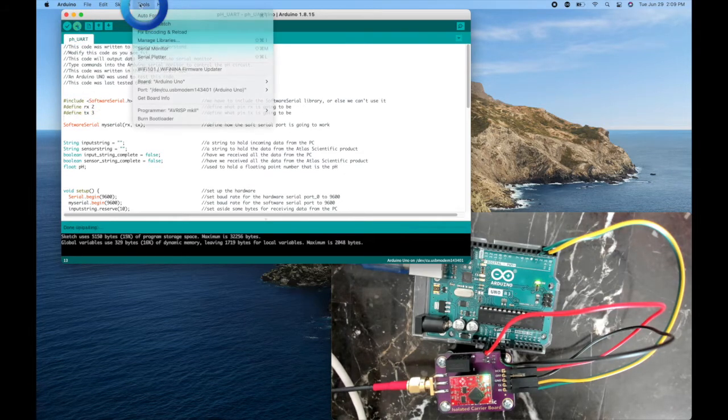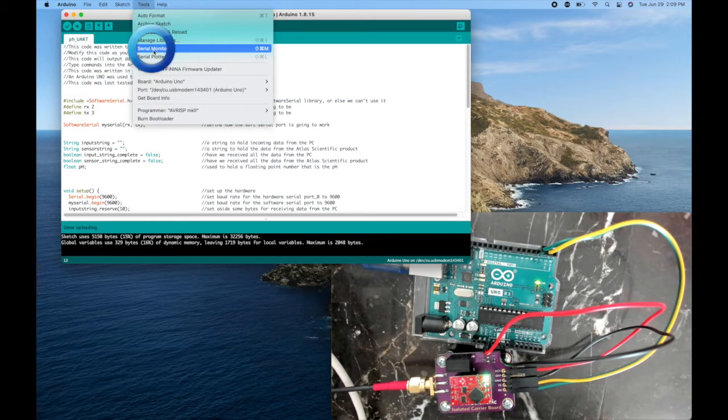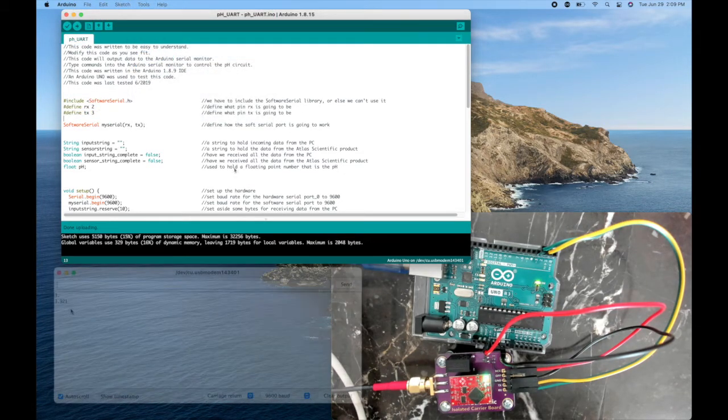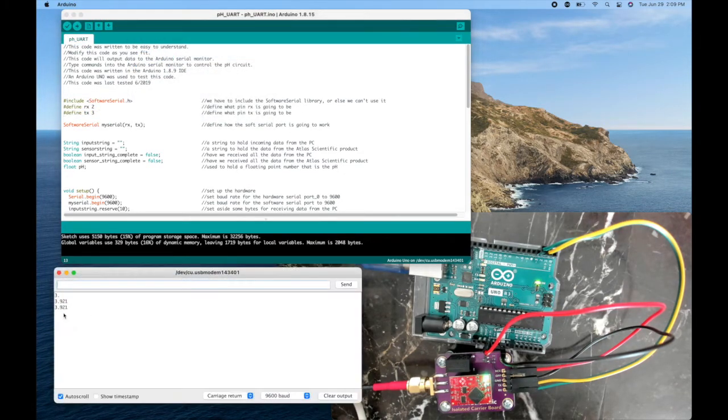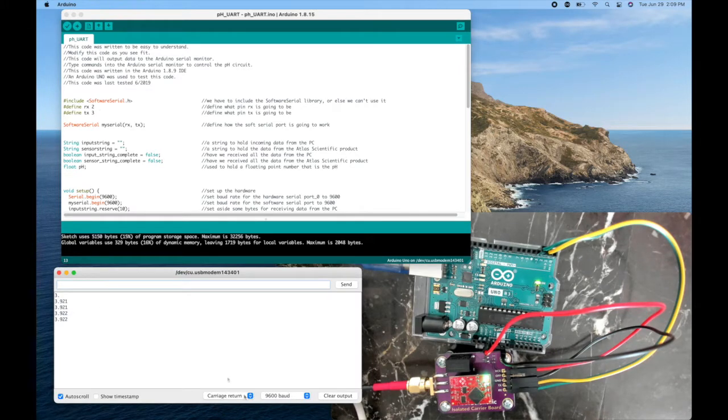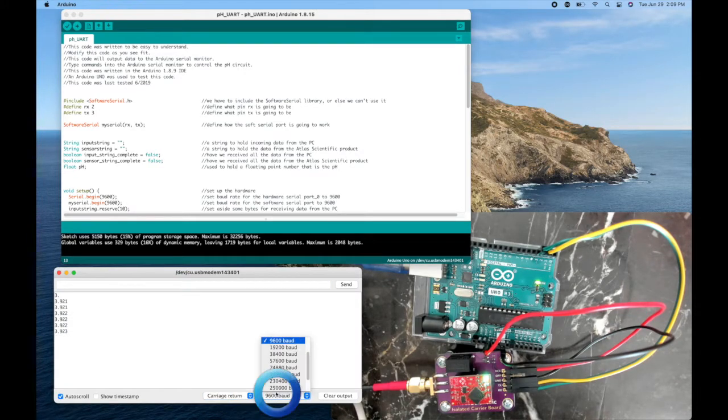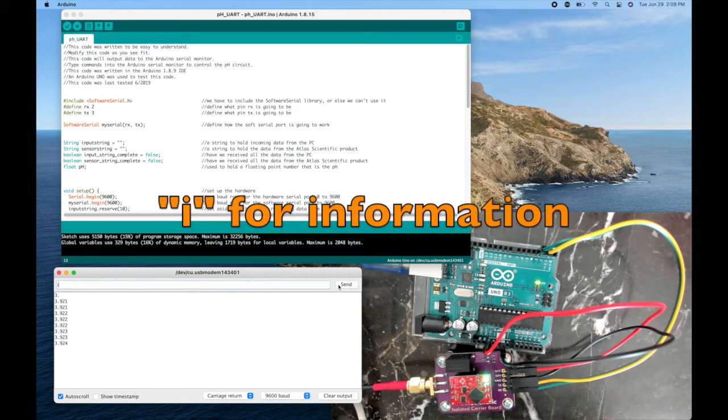Now I'll upload the code. I'll go to tools, serial monitor, and we can see that the sensor is reading once a second. Make sure you have carriage return and 9600 baud set.